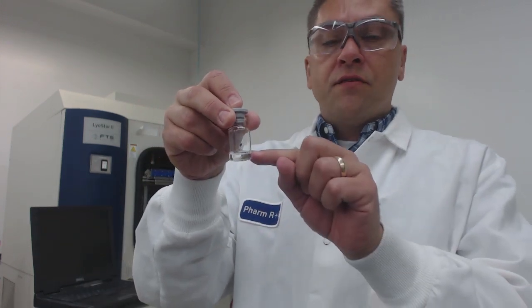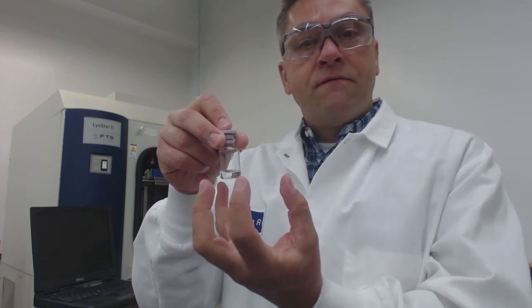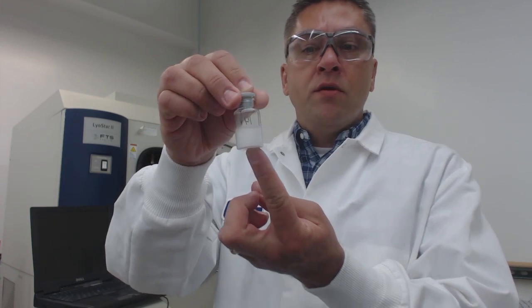Our goal is to fill vials, and here's an example of a filled vial. Our goal after freeze drying is to maintain the same height and volume of the solution that was filled. As an example of a freeze-dried product with an acceptable appearance, that's what we hope to do.